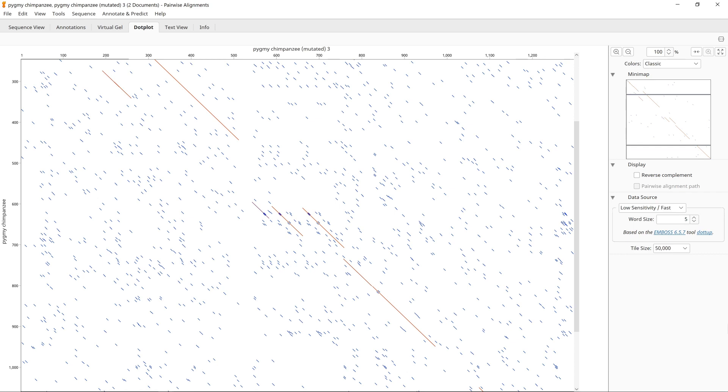Reducing it will shorten and reduce the diagonals that you see. There may be some interesting detail to be seen, but generally reducing this simply adds noise to the plot. So increasing the value will leave the strong diagonals visible and get rid of this noise.